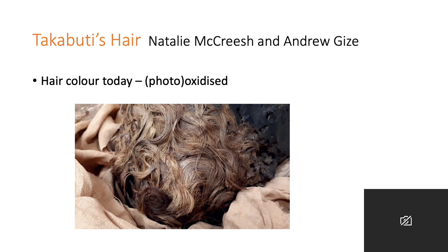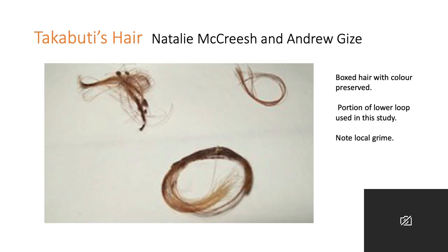Here's the hair colour today — bleached or photo-oxidized — and that's probably happened since the opening of the mummy in 1835, so it's quite a fast reaction. If we were to use that material, we would get false interpretations. But we're lucky in that some hair was boxed, and that has preserved the colour, as you can see here. For our analyses, we used the lower lock, the big one at the bottom there. But notice, obvious in both samples, is the local grime — dirt was adhering to something on the hair.